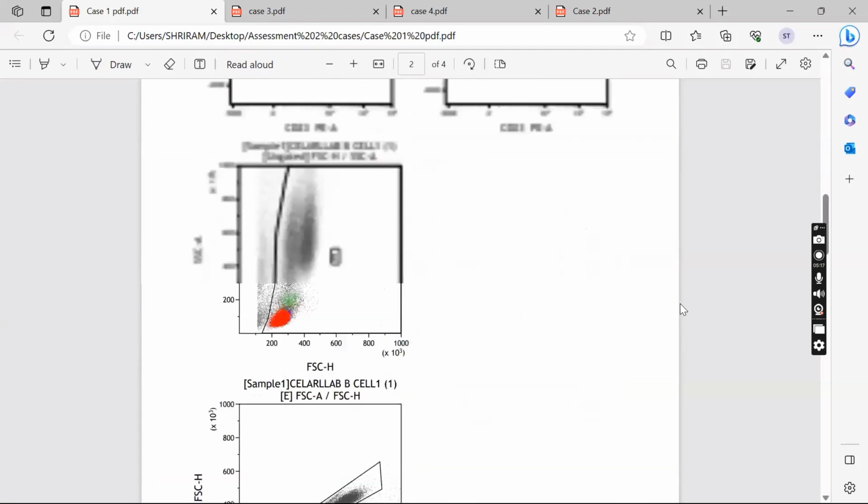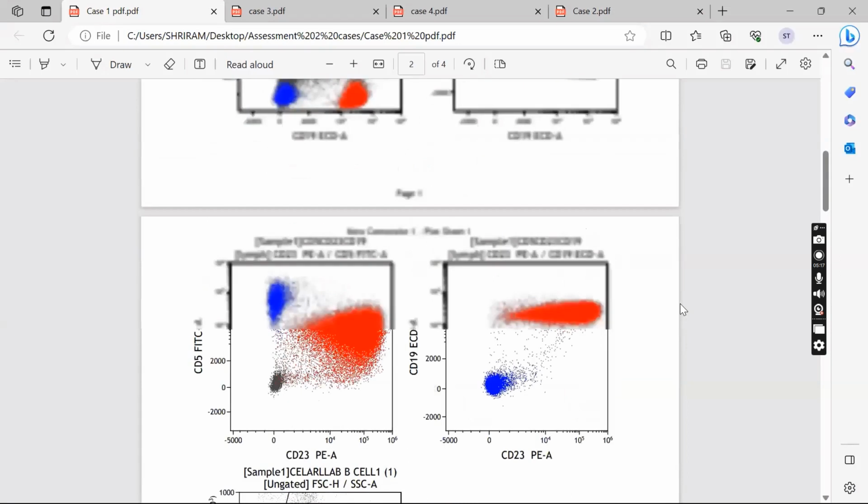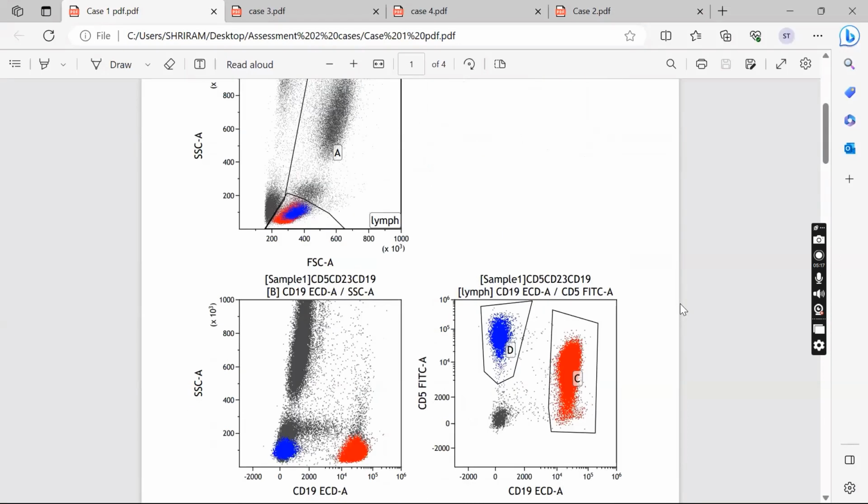Dr. Arivasan, you had a question? Someone was trying to ask a question or something. No, sir. Nothing. Perfect. So this is transitional B cell. So you try to get out that normal B cell population.